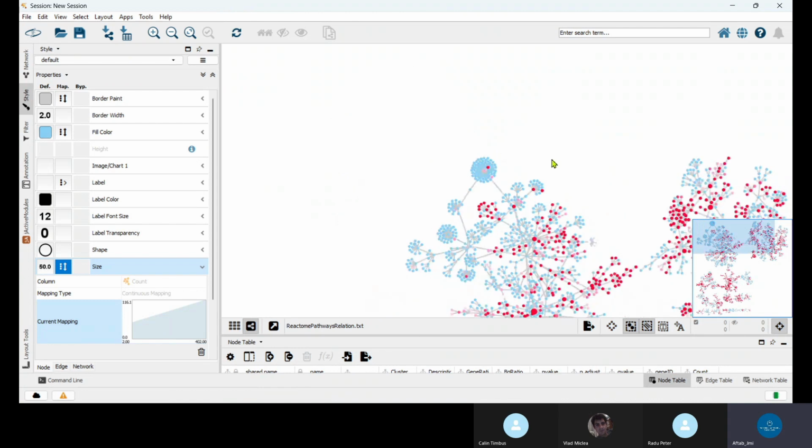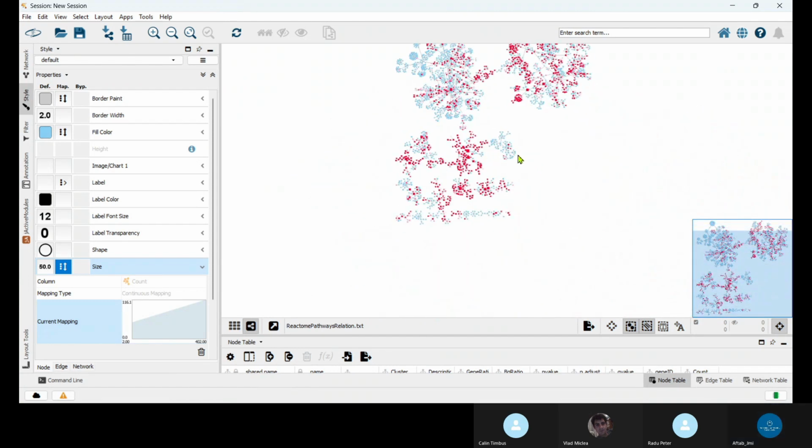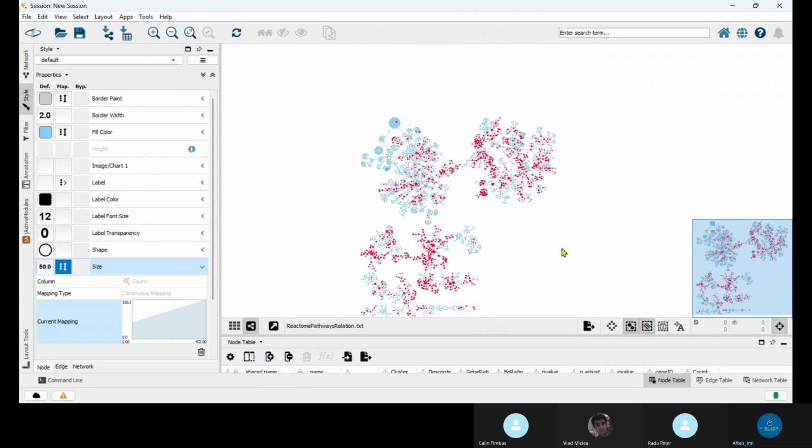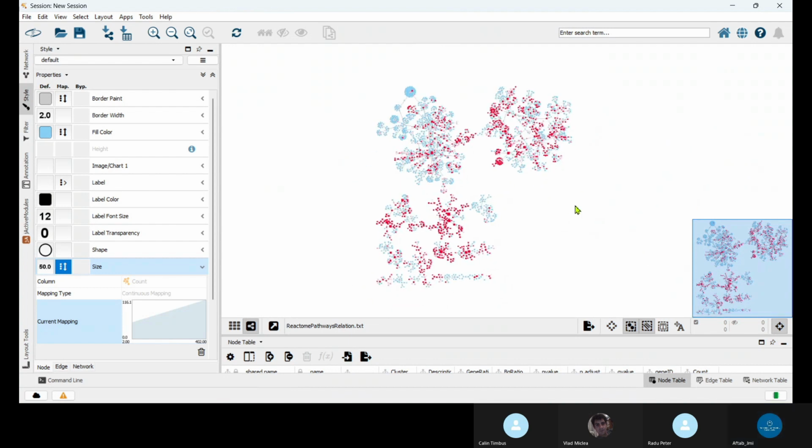That is actually good because it is the same. This area represents cell cycle, this area metabolism. That's why in our layout visualization it is easy, so you can just check which area is assigned for a particular part. Suppose this area is cell cycle, this area is apoptosis.